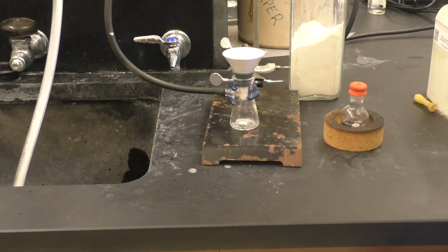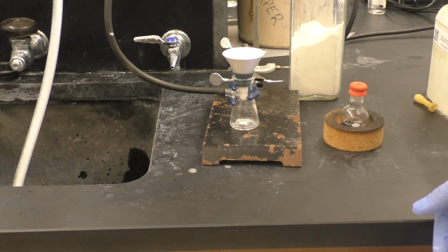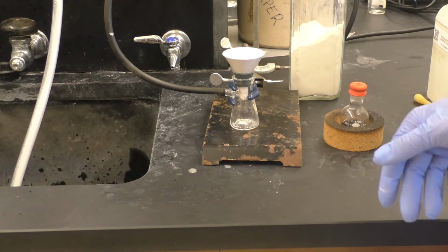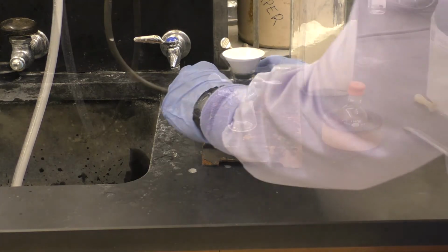All right, so the first thing you notice is that I have a small problem. I didn't wet the filter paper beforehand, and so some Celite got around the filter paper and down into the collection flask. So this is unfortunate. Probably something I should avoid and make sure that the filter paper is really seated on there well. And so I'll disconnect this and reassemble the apparatus.